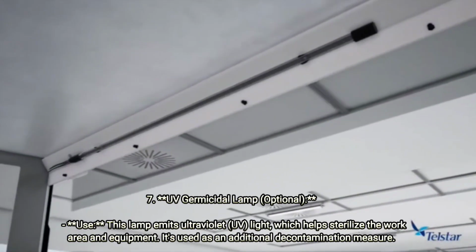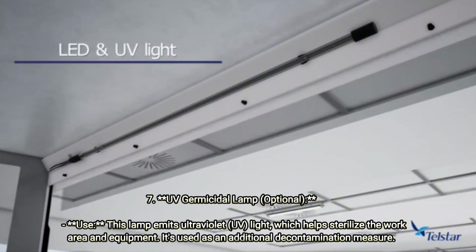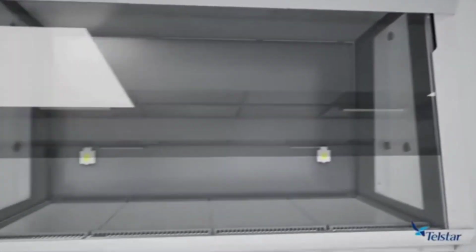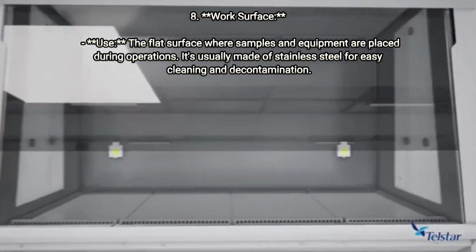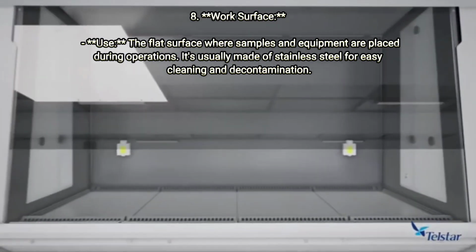UV germicidal lamp. It is optional to use. This lamp emits ultraviolet or UV light, which helps sterilize the working area and equipment. It is used as an additional decontamination measure. Work surface. The flat surface where samples and equipment are placed during operations. It is usually made of stainless steel for easy cleaning and decontamination.